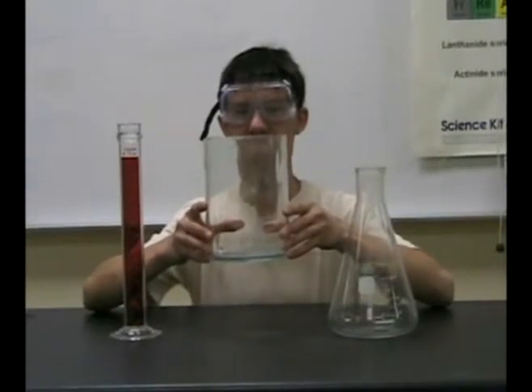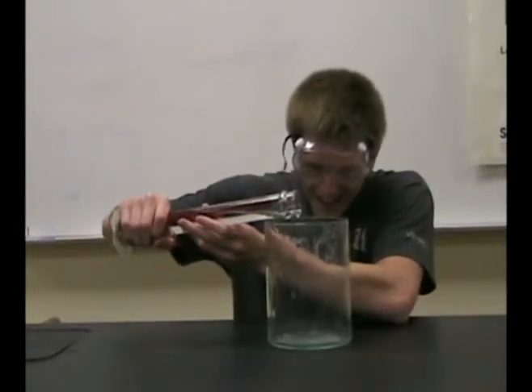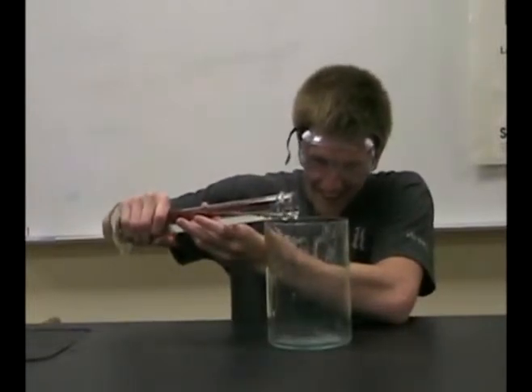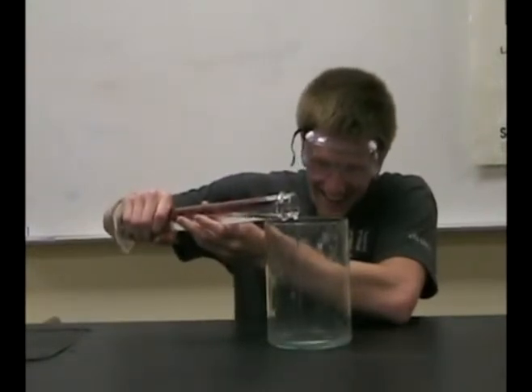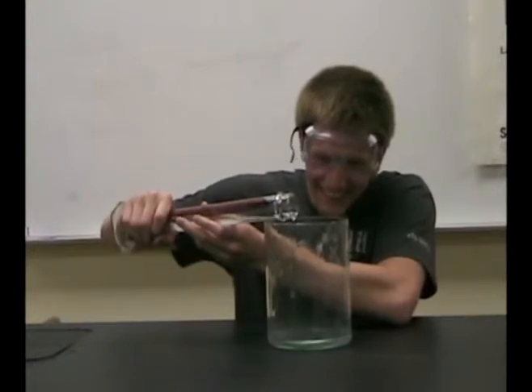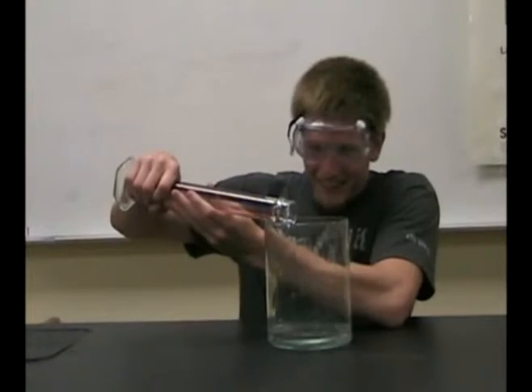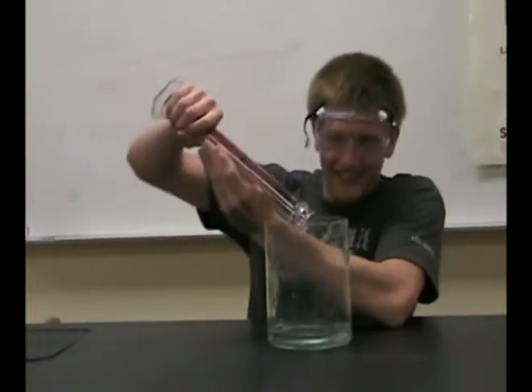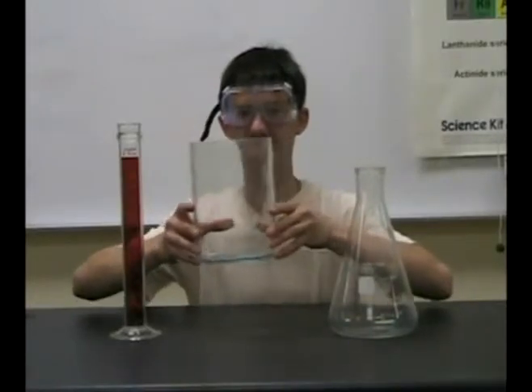The beaker is used for measuring large amounts of liquids fairly accurately. It's also used for mixing chemicals.